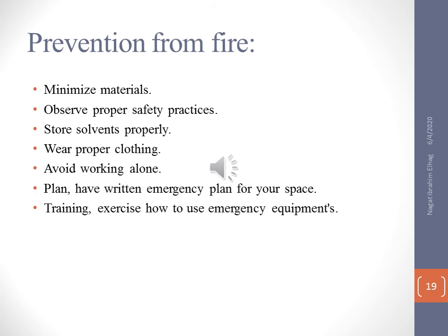Also, avoid working alone. One of those steps is not to work alone, because when you have another person with you, if any accident occurs, you can discuss with that person how to control the fire.